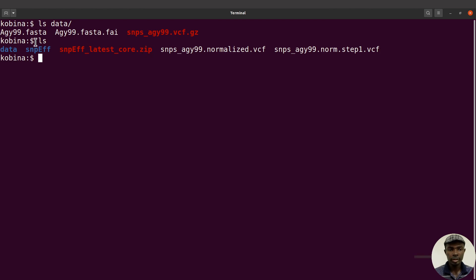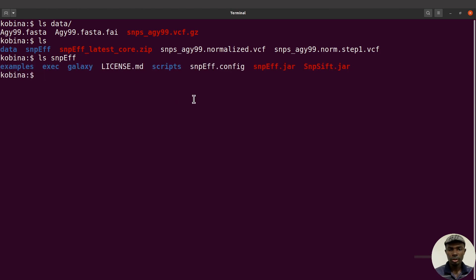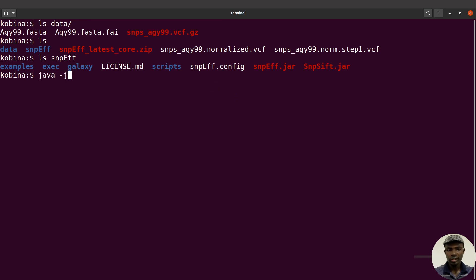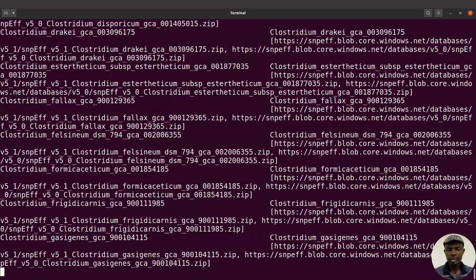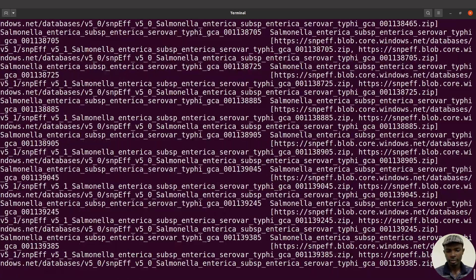Let's ls again — remember we extracted the contents of the SnpEff zip file, so the contents are here. Let's ls into it and you'll see the jar file. To list the databases in SnpEff, we say: java -jar, then specify your jar file — that's snpEff/snpEff.jar — and then we say 'databases'. Let's execute this command.